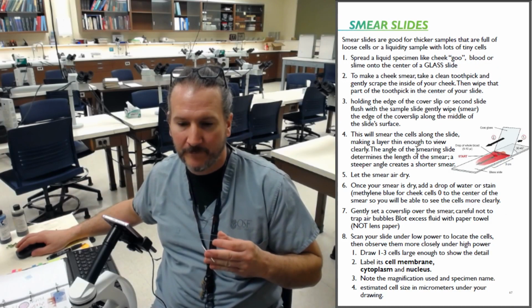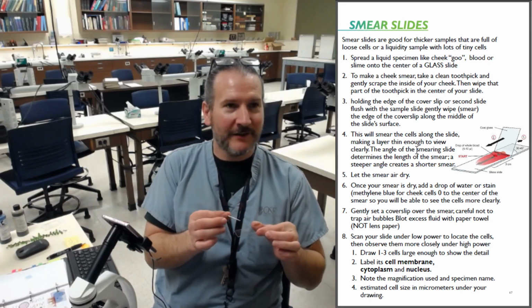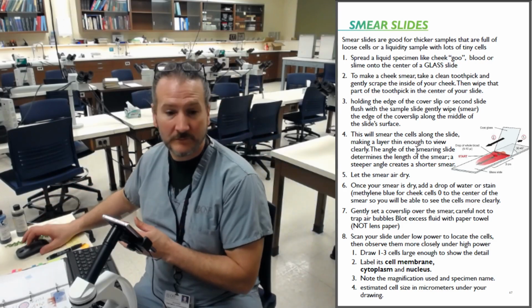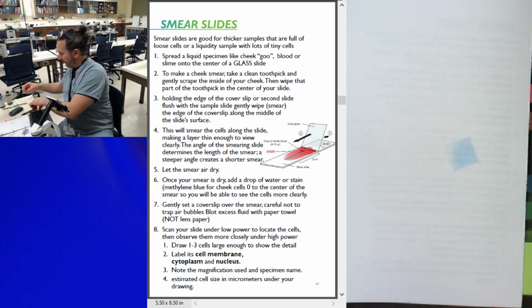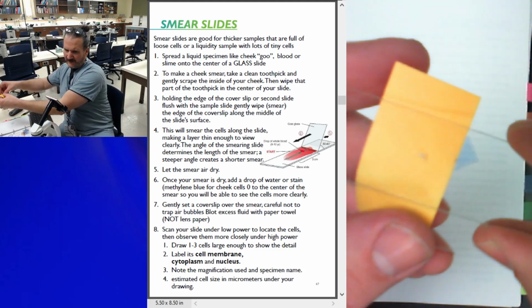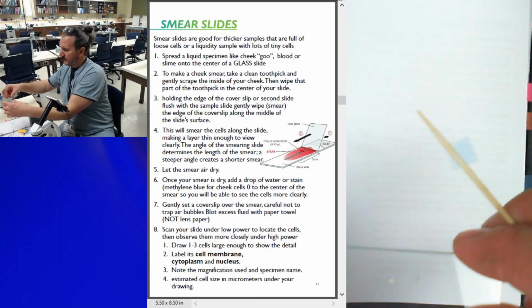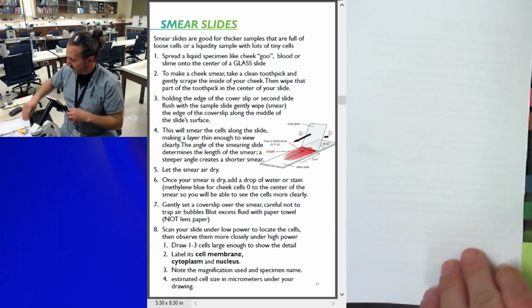let's see, we're going to make a smear slide. So with the smear slide, I said smear like it's cream cheese on a bagel, right? I'm going to put a little bit of that right in the center. You can really tell, so I'll put this here. After scraping most of my teeth, I got a little bit. I don't know if you can see very clearly. Right here above where my finger's at. Does that help? I just scraped it off the toothpick.